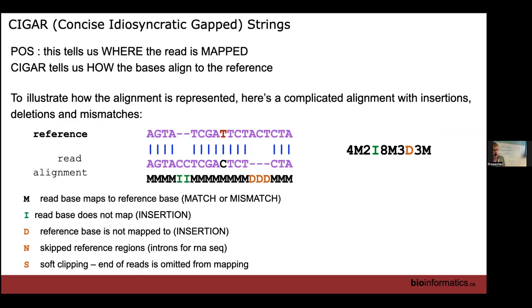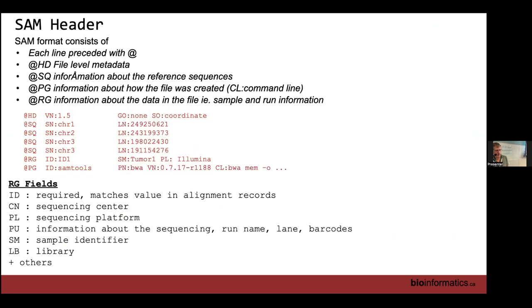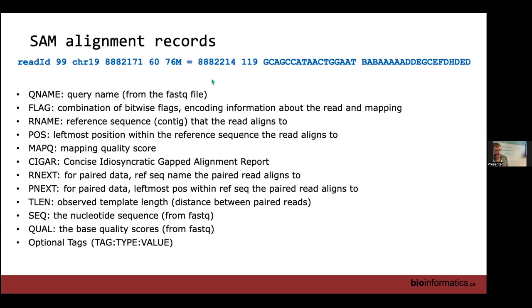Okay, the other feature I'll mention about the BAM file is the CIGAR string, which I'm going to go back and show briefly. Represented right here, this is a very simple string. Again, I mentioned this as an indication that 76 bases are mapped one-to-one against the reference.